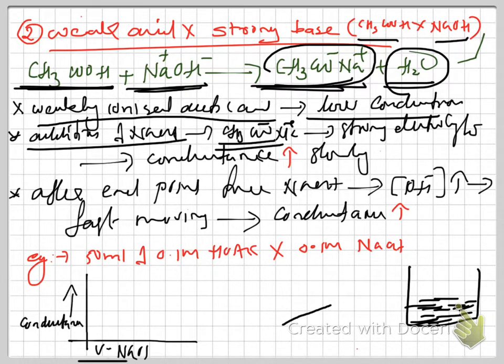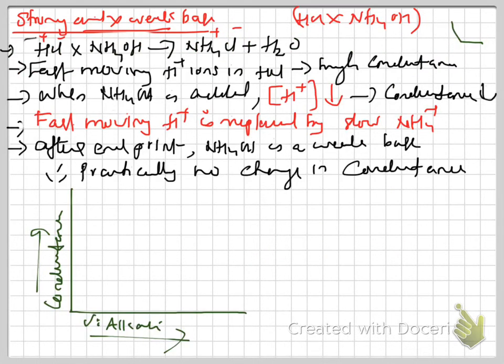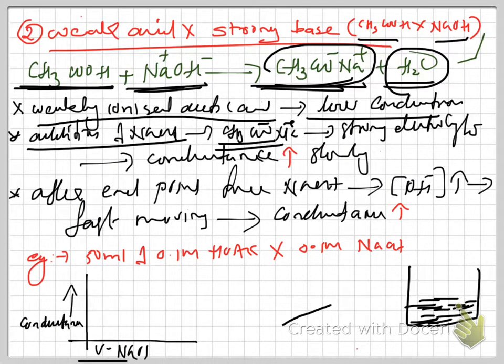Volume of NaOH here and conductance here, we will get a slow increase. This process continues until the endpoint. At that endpoint, complete neutralization is over.